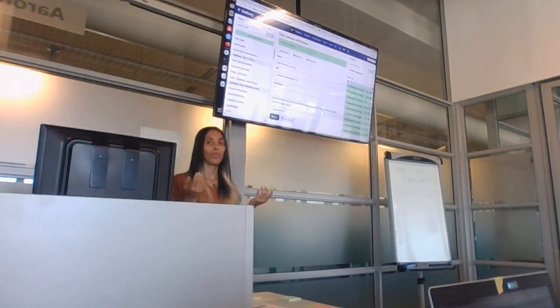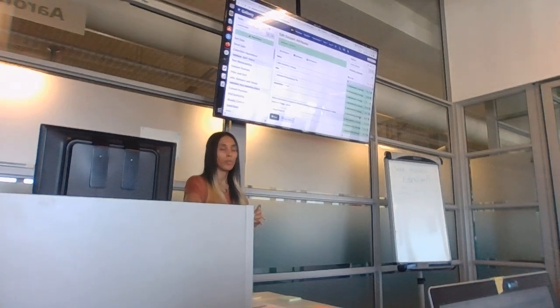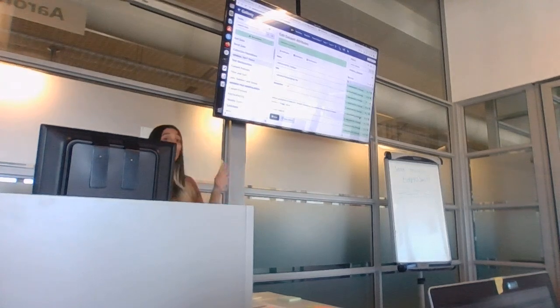Okay, half of you. What are some of the things that you see in the file name? Underscore R1. Okay, is it always R1? Sometimes just 1. Sometimes 001. I've seen that. Sometimes an F and an R, just to show forward and reverse. I don't come across that often, but sometimes.